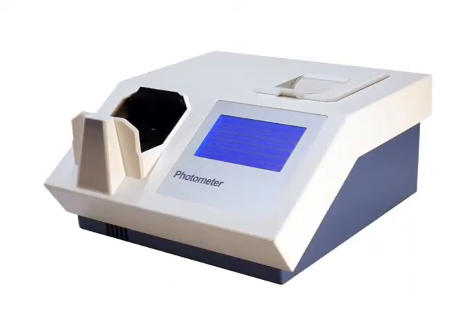A filter photometer is often called a single beam instrument as it has a single optical path between the source and the detector. This type of instrument consists of only one sample holder for both blank and sample. The instrument needs to be calibrated before use. It is calibrated to two extreme values, that is to 0% transmission by using a shutter to block the source radiation from the detector.